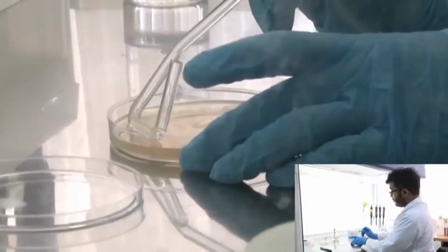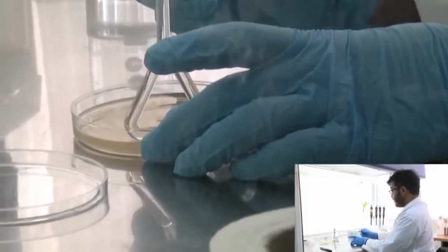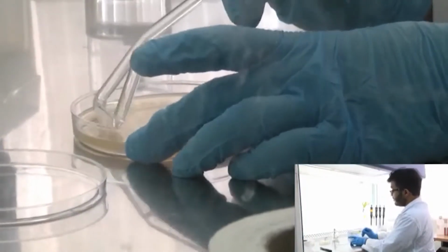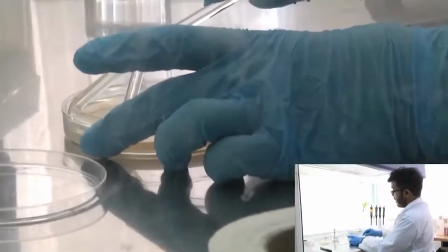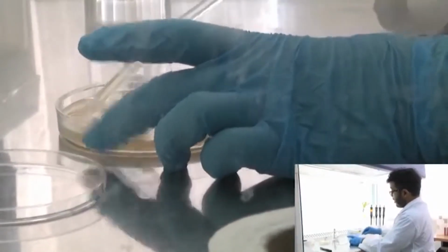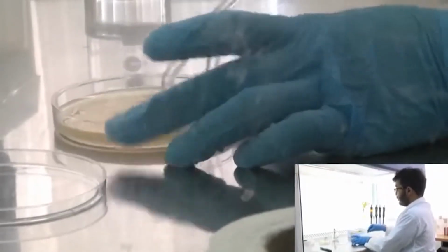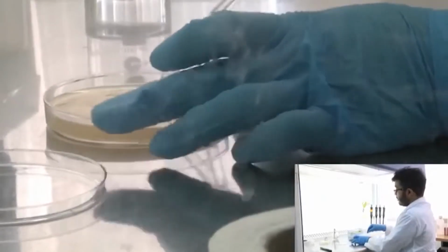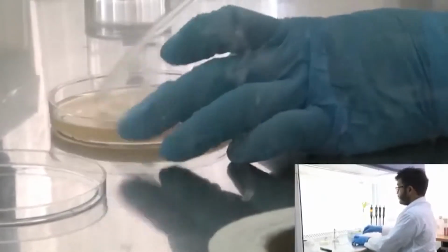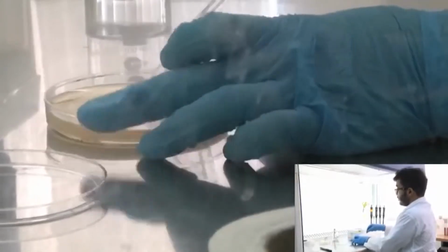So it's cool, I believe. I'm just going to touch the spreader to the edges of the plate, so that in case there is any residual heat, it gets dissipated into the media, not on the culture which is at the center of the plate. And once I'm ready, now I just do this to and fro motion with one hand for the spreader, and with my other hand I'm rotating the plate. This will ensure uniform spreading of the culture.